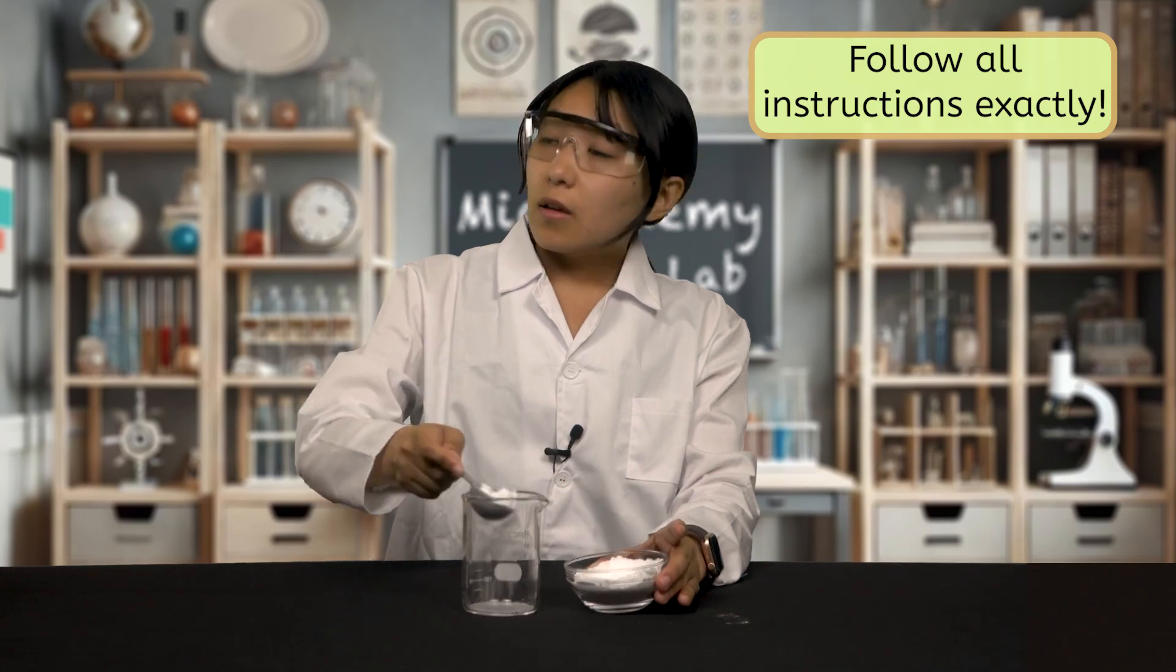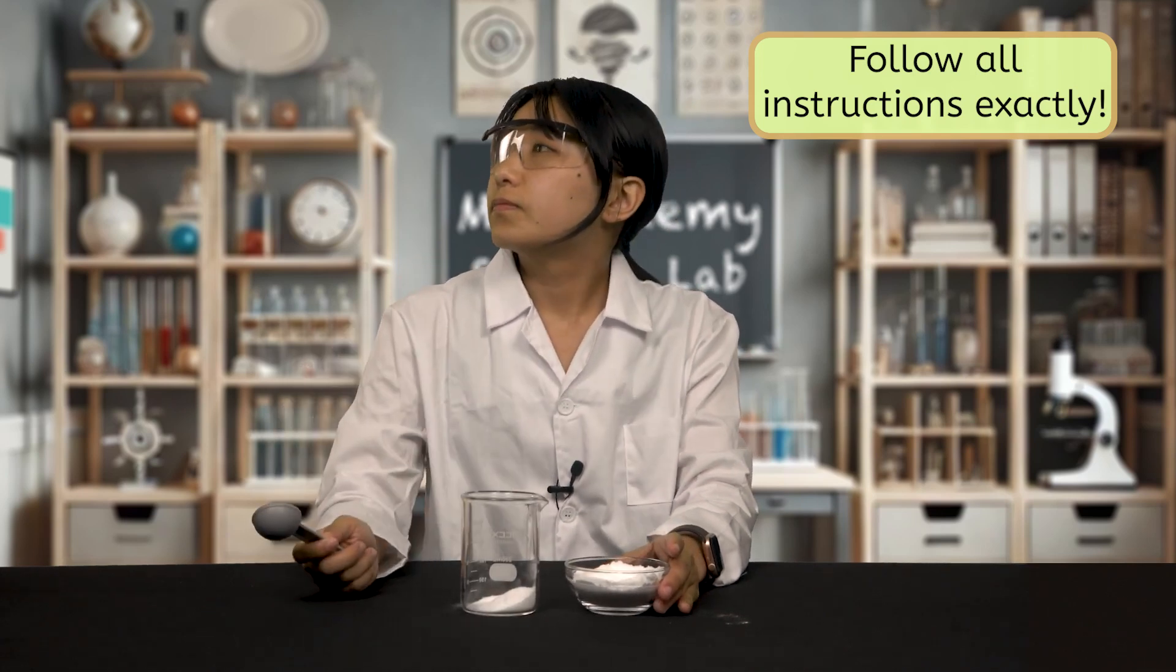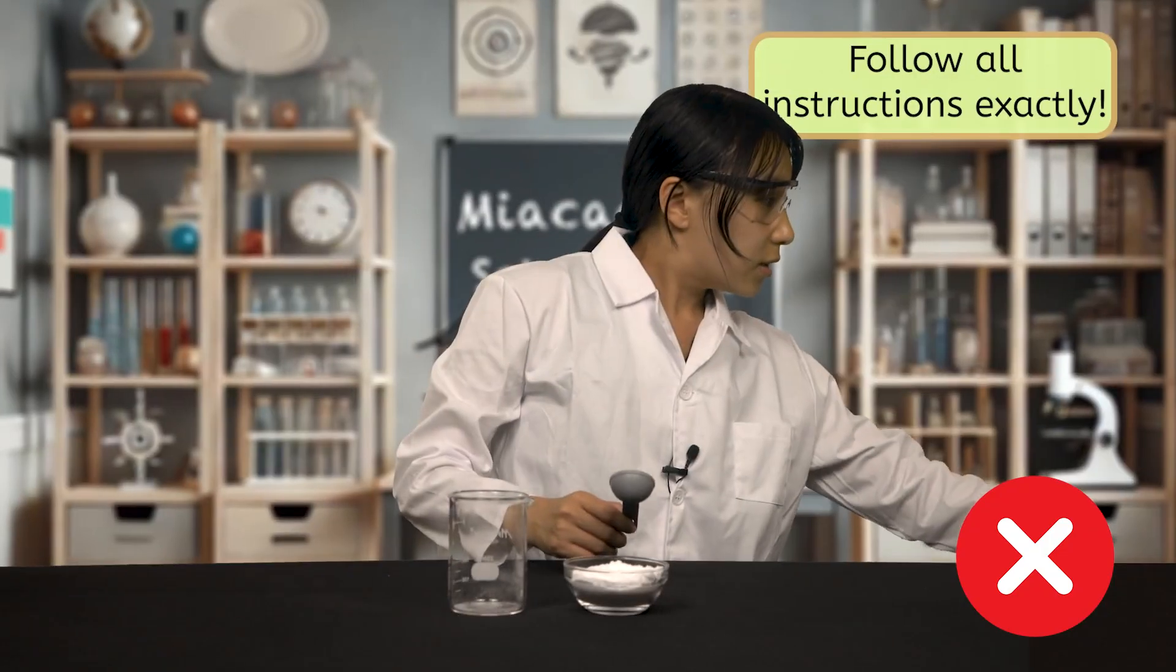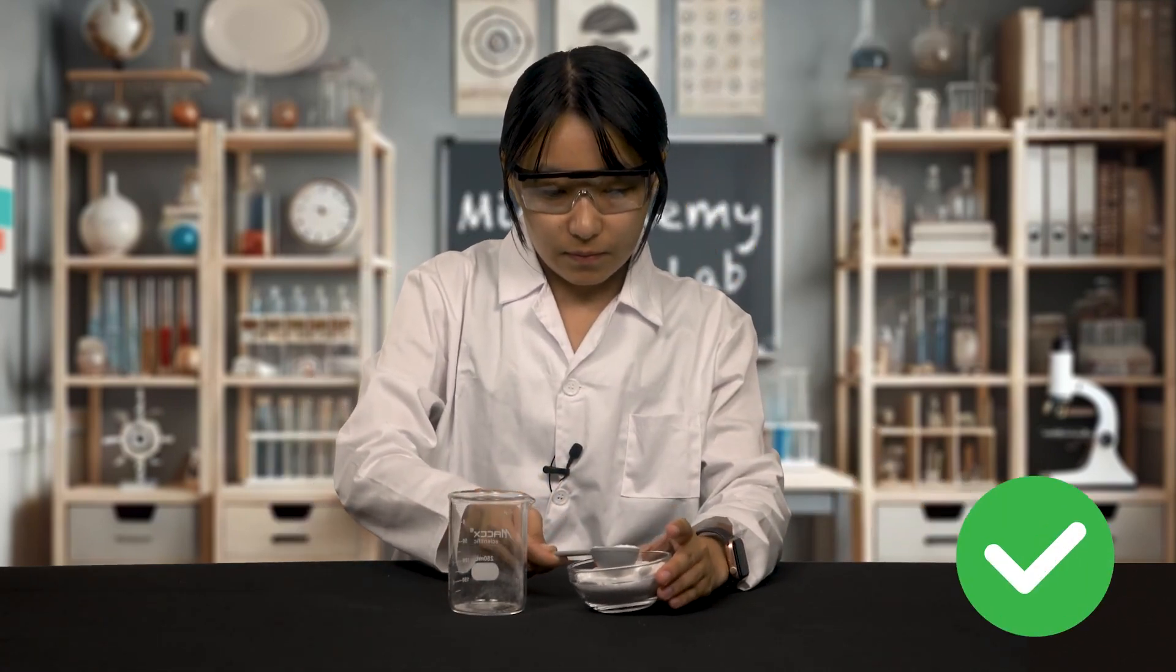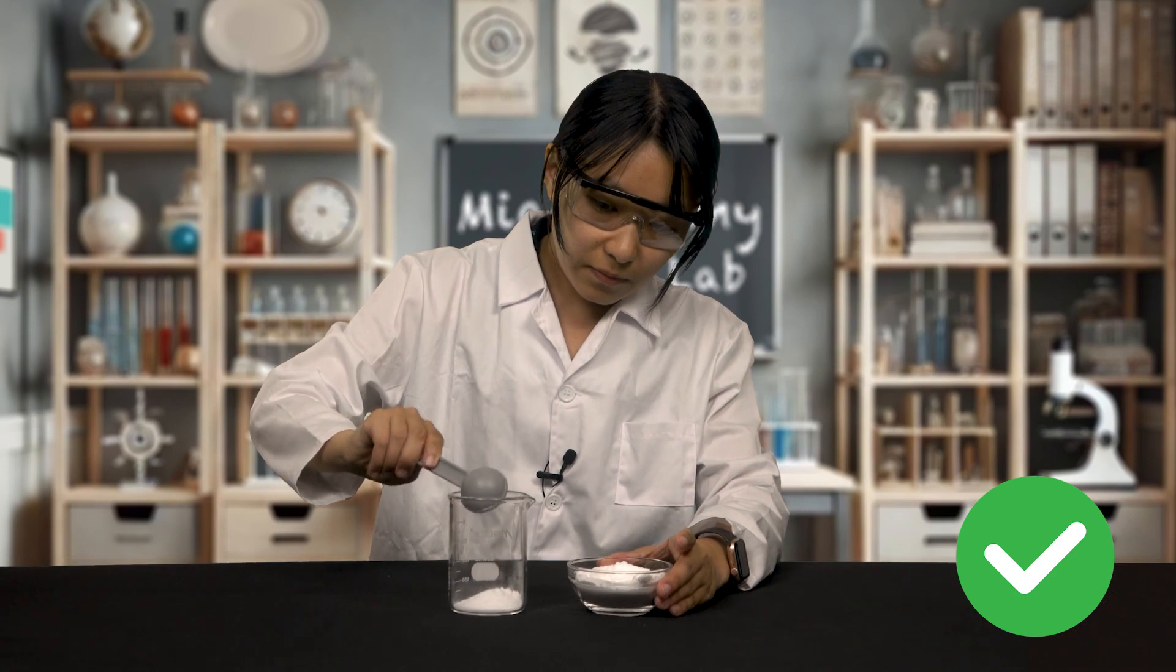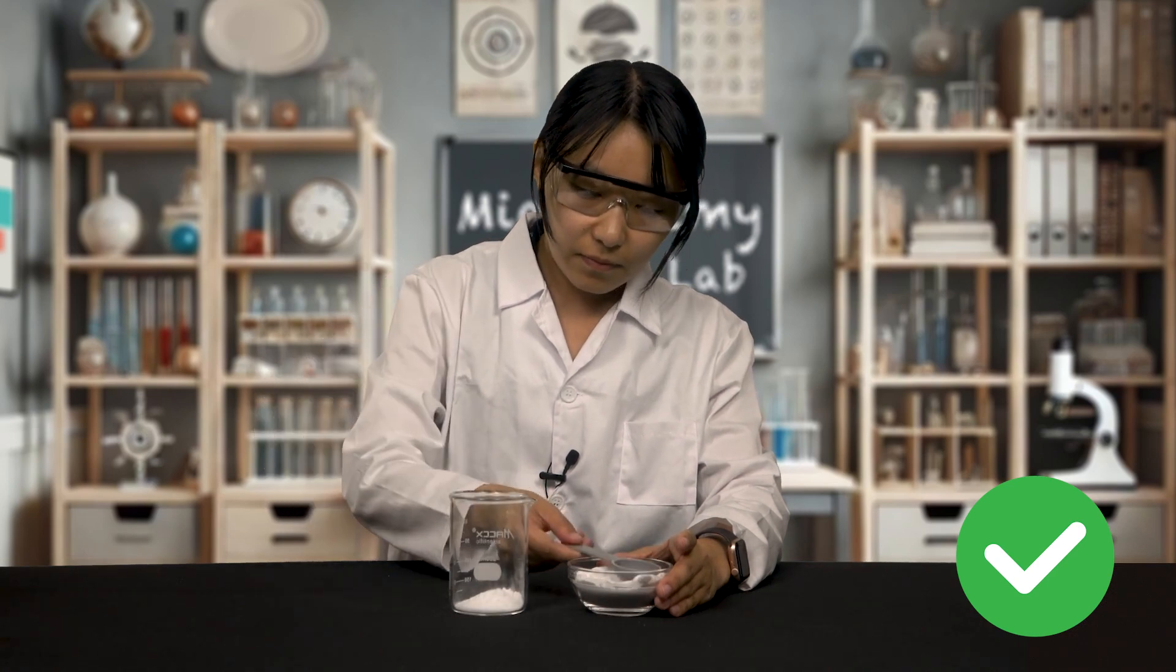Now for the third and most important P, prevent. Prevention is all about building safe science habits so that accidents don't happen in the first place. It's like following the rules of a game to keep it safe and fun. So what exactly are these safe habits? First, follow all instructions exactly. If a lab calls for a tablespoon of baking soda, don't eyeball it. Don't add extra. Measure it. Not only could you mess up your results, but doing things differently from the instructions can be unsafe.